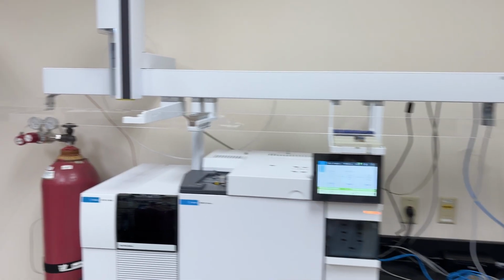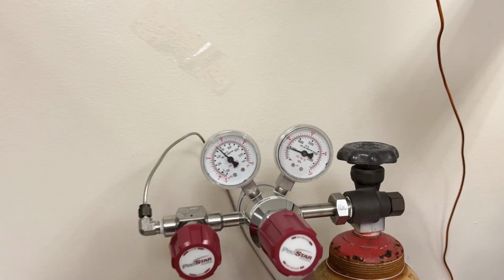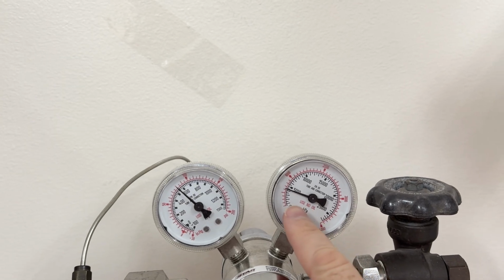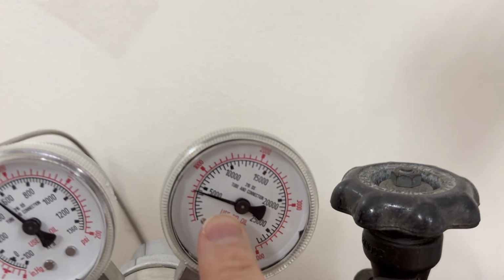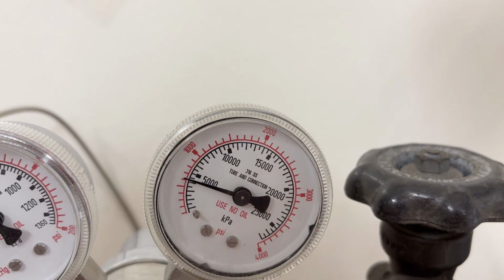As with any instrument that requires gases or fluids for that matter, the first thing you're going to do is check the gas levels. Go over to the regulator, look at the level in PSI on the gauge on the right. Here we're at a little bit above 500, so at this point you would want to tell me or your mentor we need more gas. Anytime you're getting near 500, that's when we want to think about starting to change the tank. This is the helium gas, and you cannot run this instrument without the helium, the carrier gas.